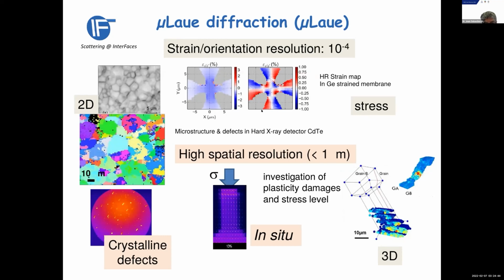And you have a high spatial resolution, so less than 1 micron. You can do in situ measurements, and you can have quite valuable information on the crystalline defects in the materials, and you can also perform some 3D measurement.